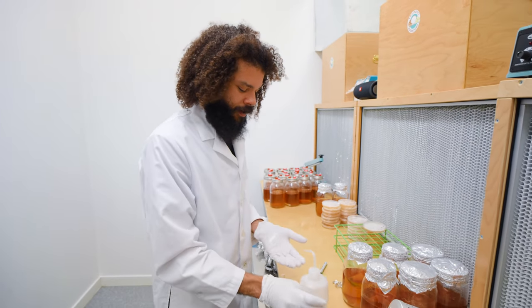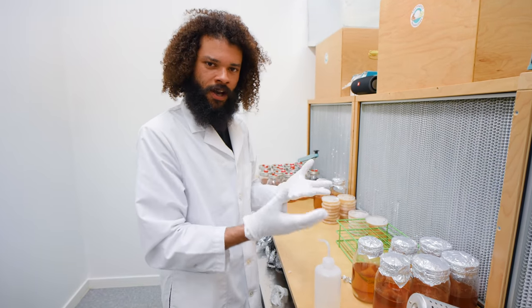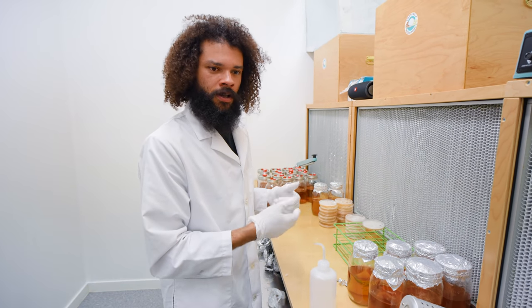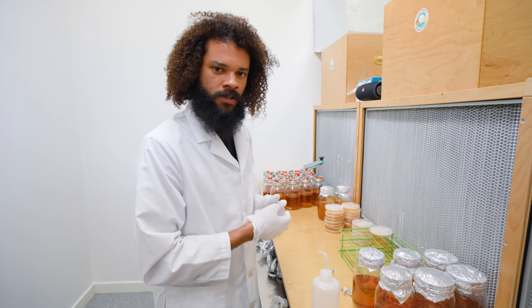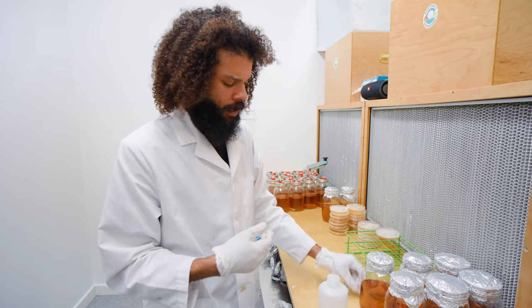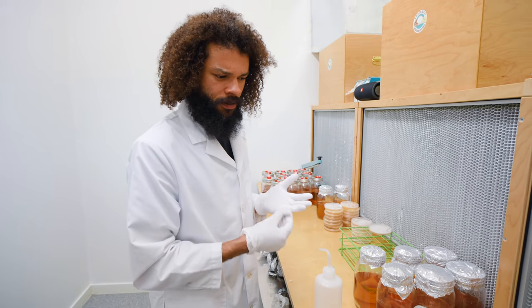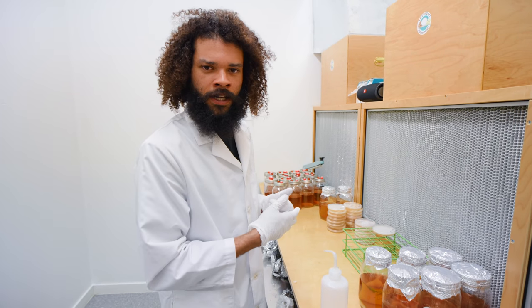I'm constantly dousing my hands with isopropyl alcohol to sanitize them between transfers, and that happens repeatedly throughout the day. Without gloves I've tried it before — you end up with severely cracked hands that start bleeding. Gloves really do come in handy for this kind of work.